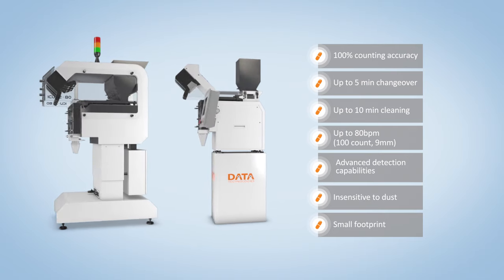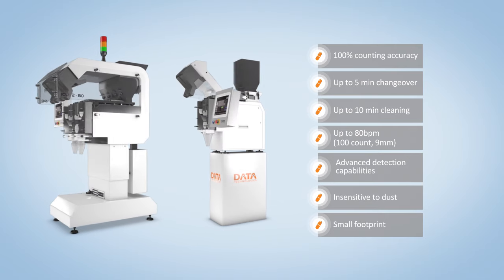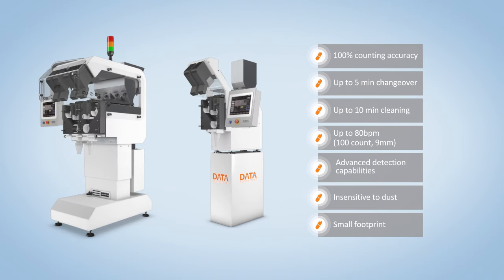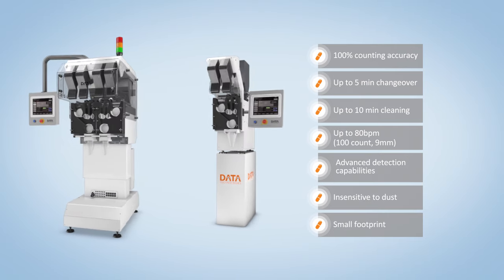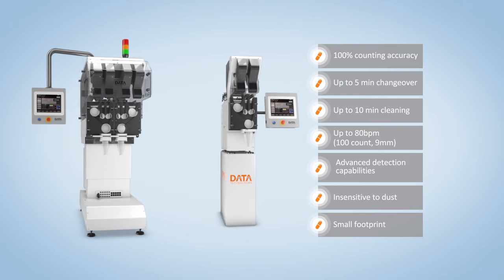While setting a new standard for counting, Datatex ICU is designed to cope with all major industry challenges.